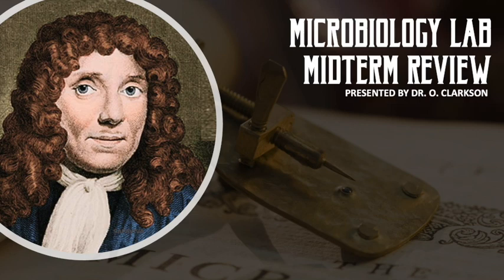Now, when it comes to gram staining, we use crystal violet, right? We also use iodine. What's that iodine called technically in gram staining? It's a mordant, yeah, and the mordant allows what? It helps fix the color. Exactly. It helps that primary stain remain fixed within a gram-positive organism, so it gets held more tightly into the cell.